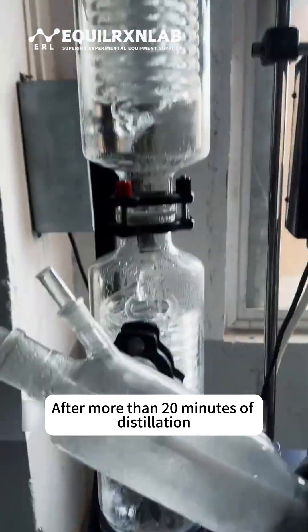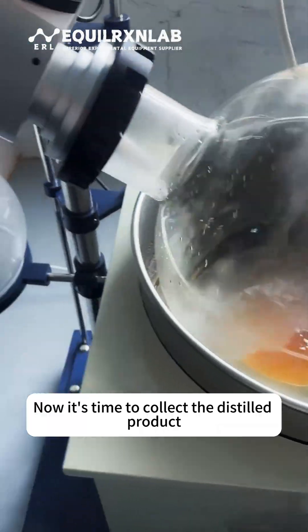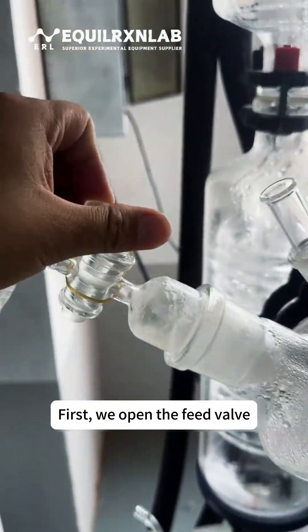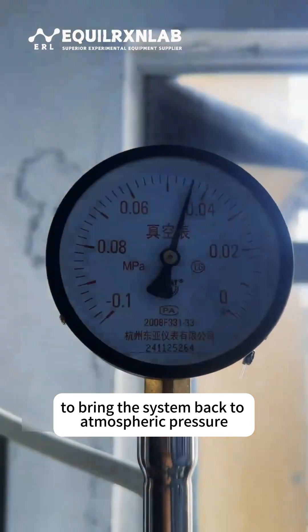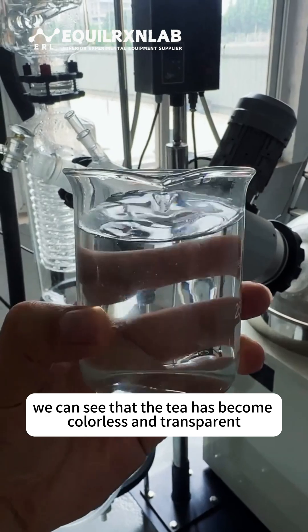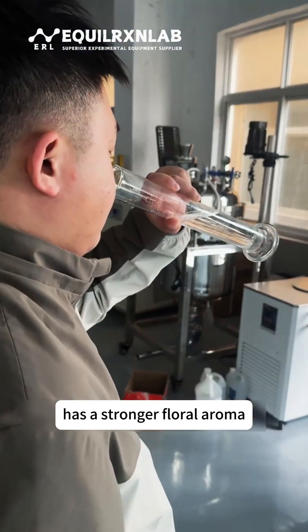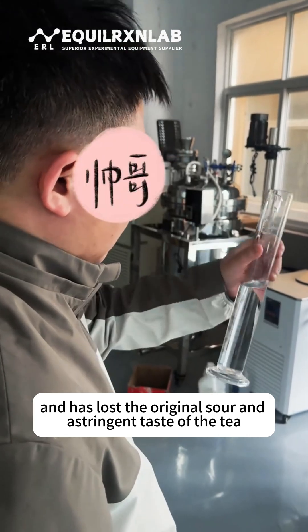After more than 20 minutes of distillation, a large amount of clear liquid has been collected in the receiving flask. Now it's time to collect the distilled product. First, we open the feed valve to bring the system back to atmospheric pressure. Then we open the bottom discharge valve and collect the liquid into a beaker. Looking through the beaker, we can see that the tea has become colorless and transparent. The distilled jasmine tea has a stronger floral aroma and has lost the original sour and astringent taste of the tea.